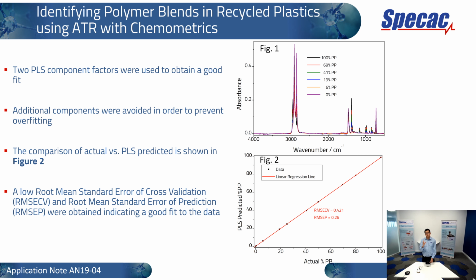After we've collected the spectra in figure 1 and converted that data into the plot in figure 2, yes, just really strong correlation there to tell us the amount of impurities, if any, in our polyethylene end product before we recycle it or reuse it, so that the properties of your end polymer product are not compromised by having these impurities.